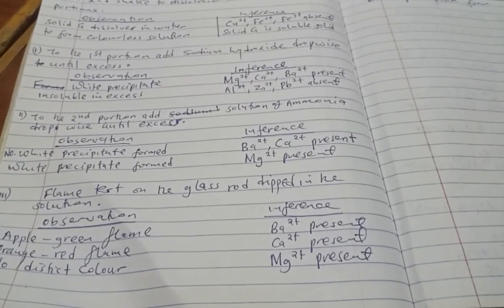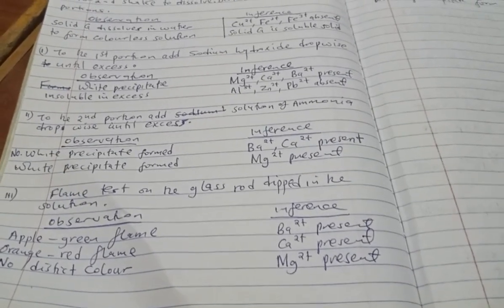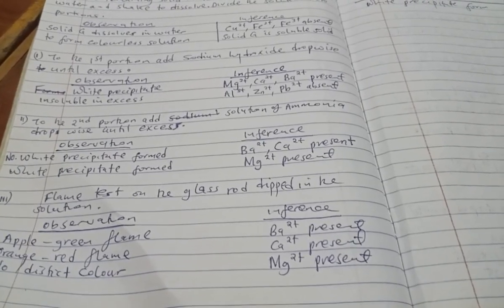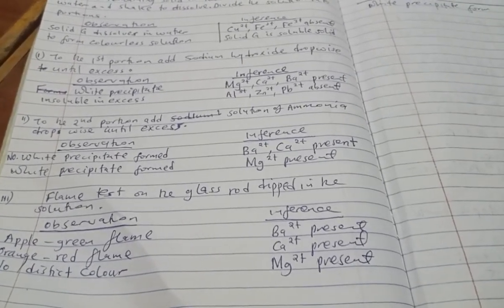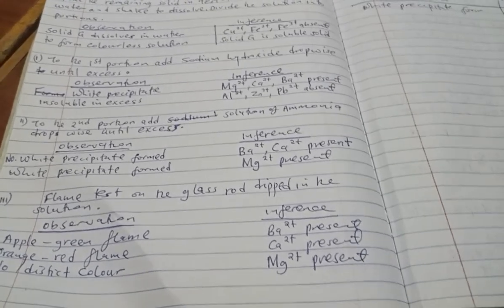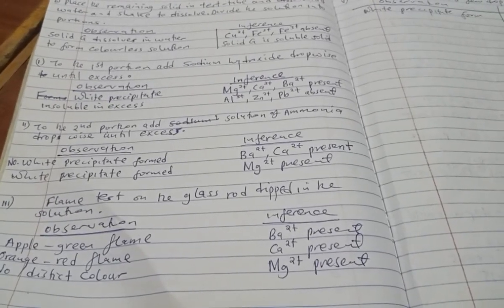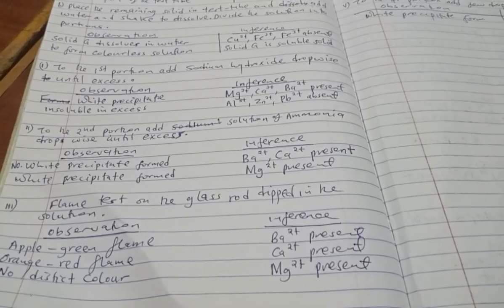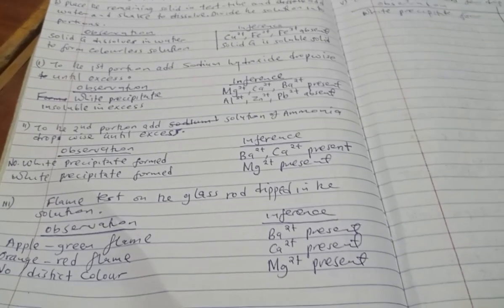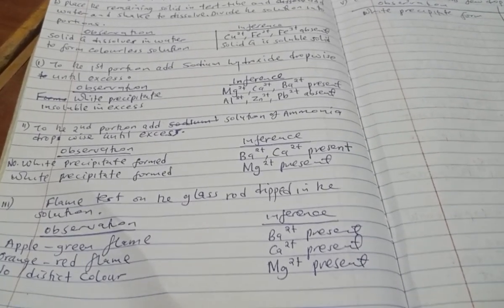So if it is barium, you see an apple green flame. Some people say that it is pale green, but when I was a student, the book I read in school said apple green flame. So your teacher can confirm that. If you see an apple green flame, that is barium present.